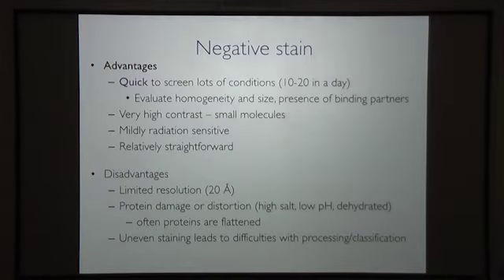Disadvantages of negative stain are, of course, it has limited resolution. And sometimes proteins can be damaged or distorted. But in our experience, if a sample looks really good in negative stain, it's much more likely to behave well in cryo.